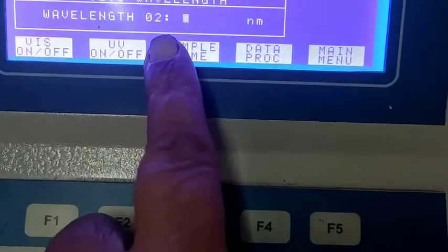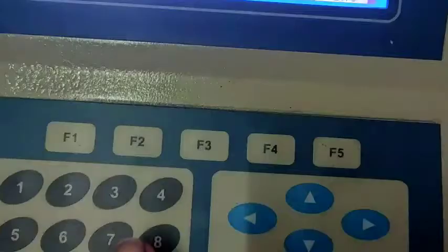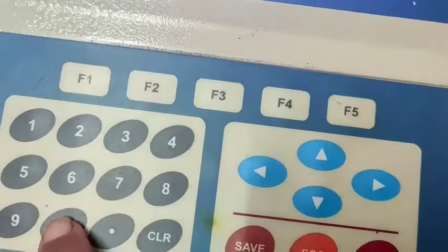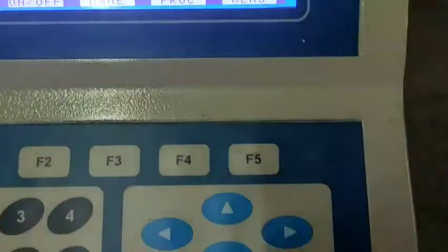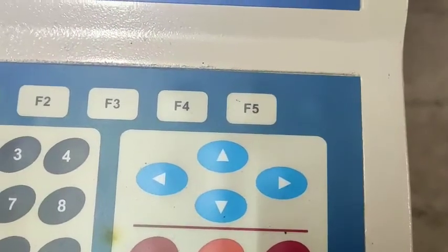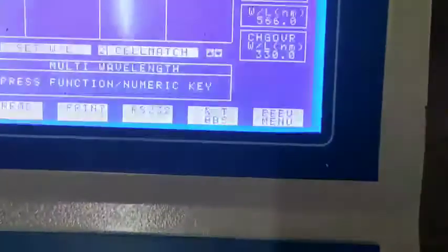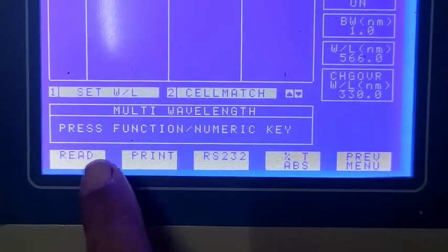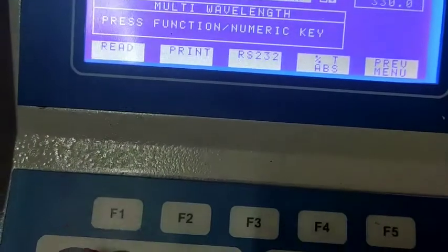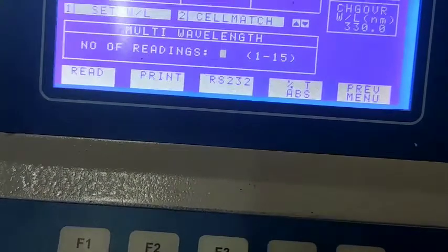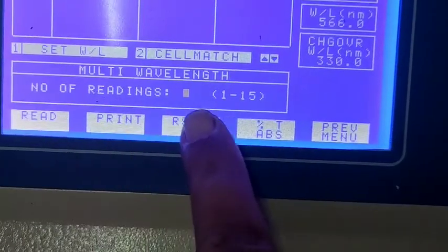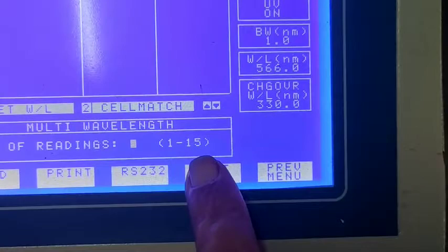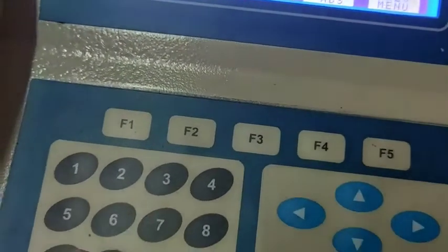After entering the first wavelength, it will ask on which second wavelength you want to work. Because I have selected 2, I am going to press 560 — I want to note absorbance of the potassium permanganate solution at both 360 and 560. Then press Enter. Now it is ready to note absorbance of the sample on 2 different wavelengths. I want to read only, so I have pressed F1. It asks: number of readings. I want 8 readings this time, so I have pressed 8, then Enter.